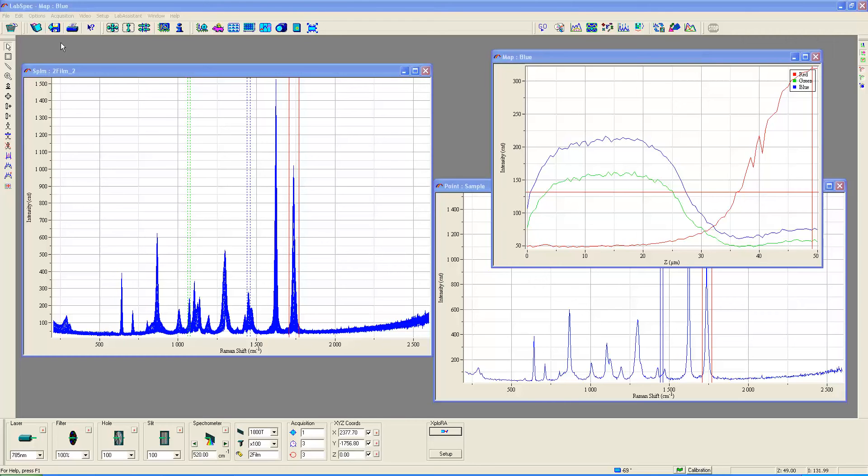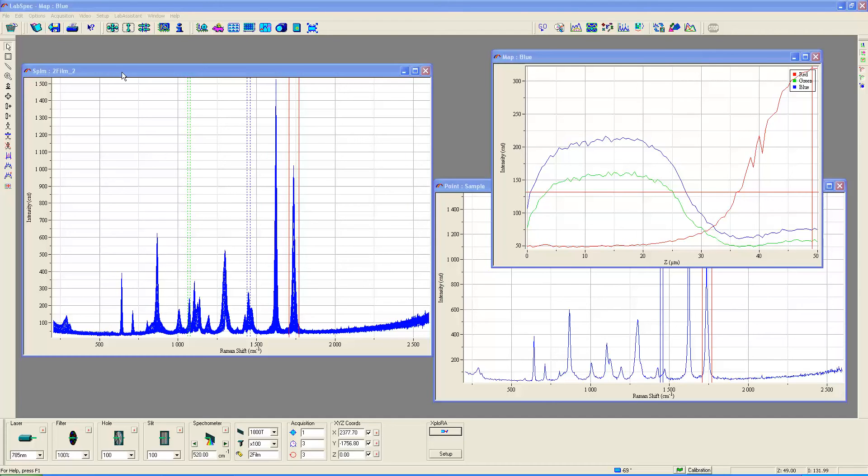That's what we'll look at today and I'll show you not the actual data acquisition but then how to treat the data afterward when you have obtained this depth profiling.